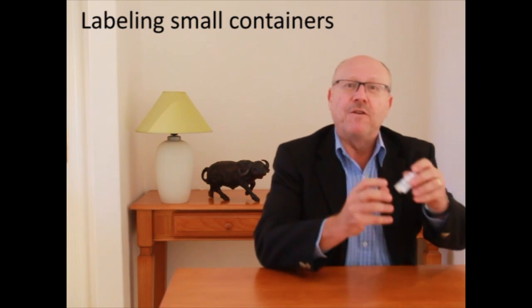Let's look at a container of this size, about 10 milliliters. How on earth do you put a label on it with the signal word, all the pictograms, and hazard and precautionary statements? How do you get this onto one small container?